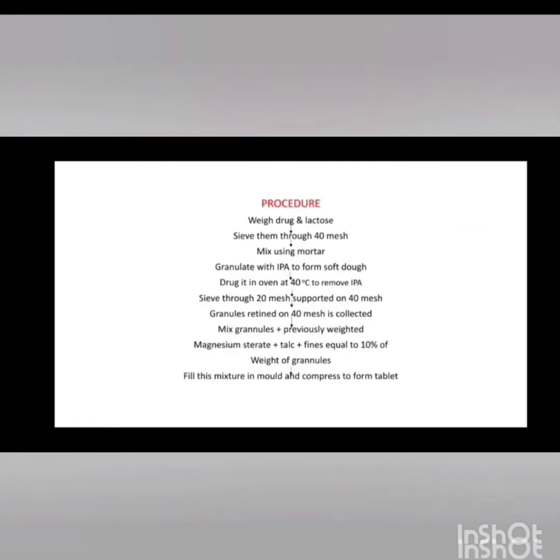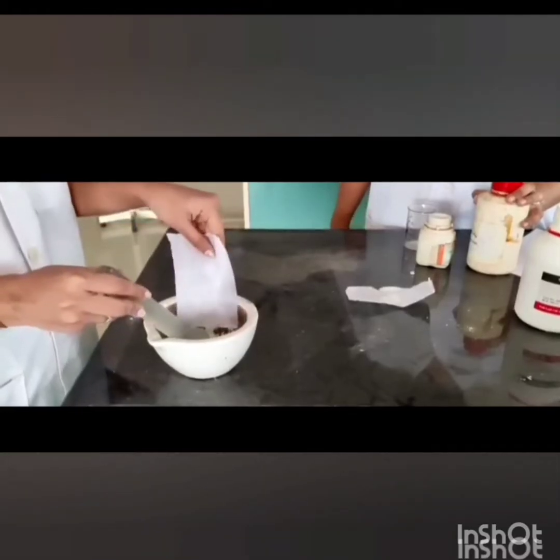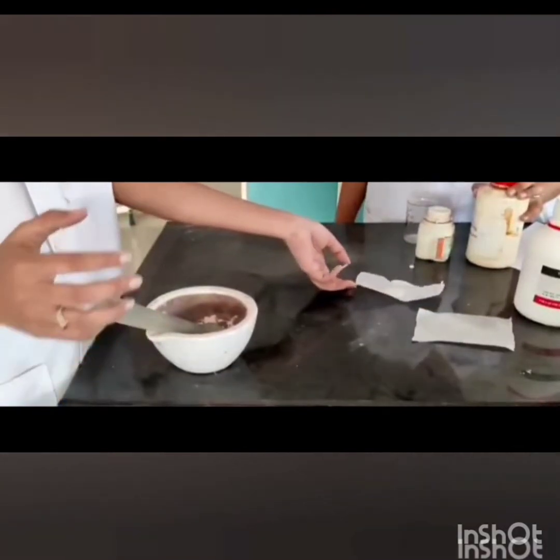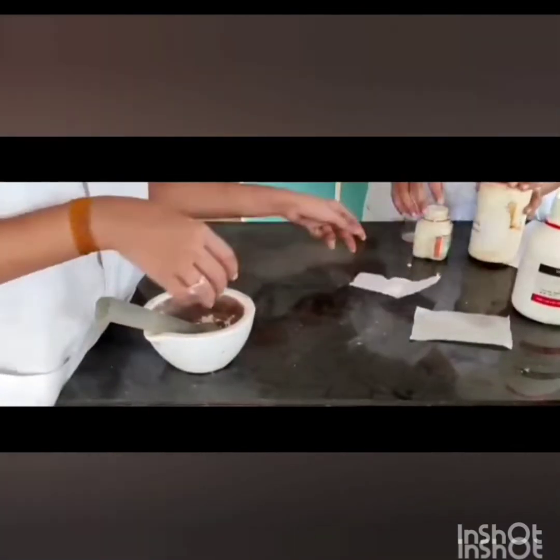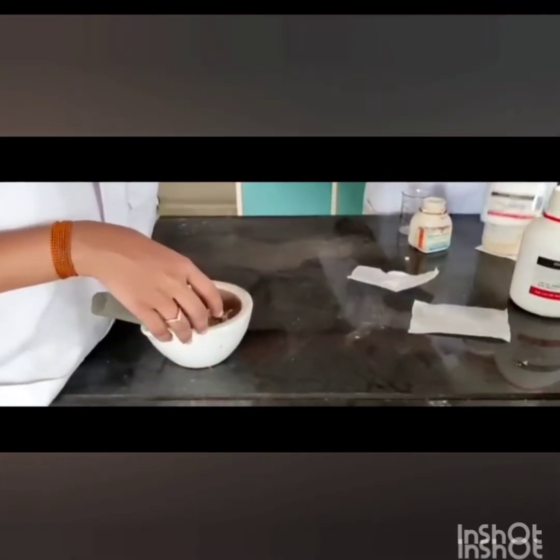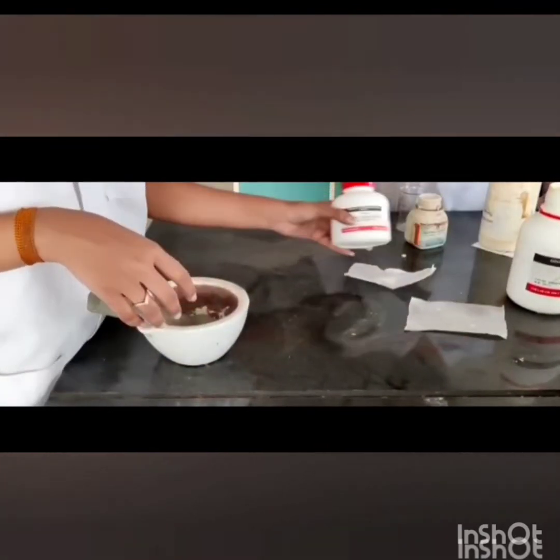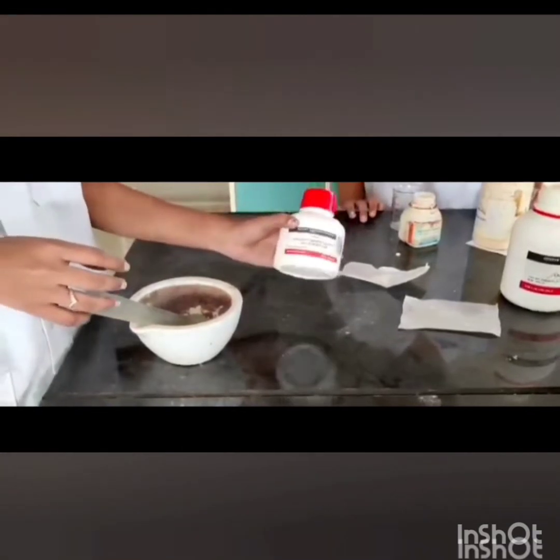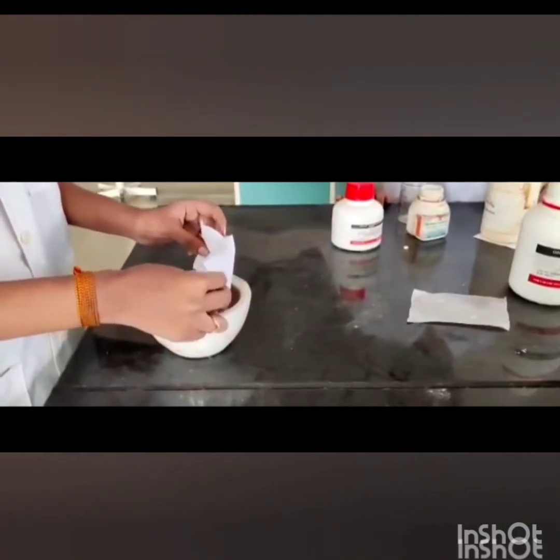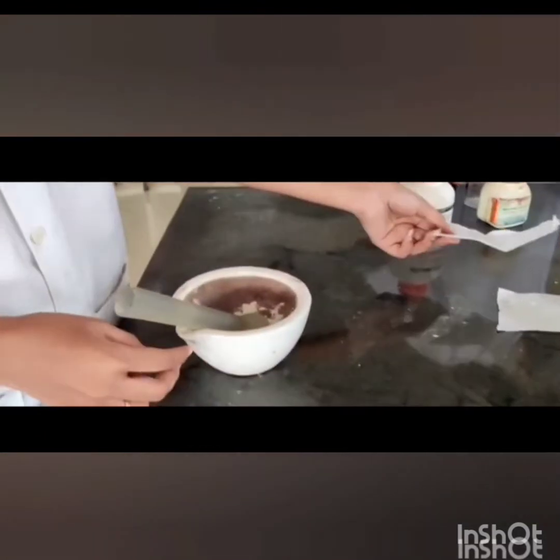This is the procedure. First, we have to weigh diclofenac sodium and lactose and pass it through a mesh. Then we have to mix it in a mortar and add IPA — that is, isopropyl alcohol — to it.